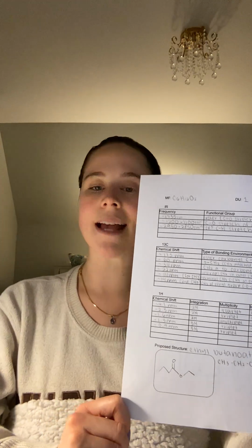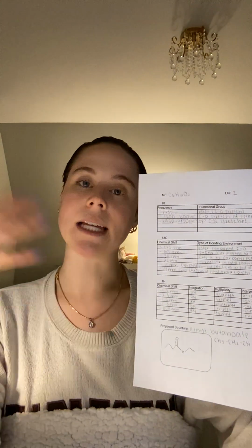And next to this is the 3H triplet at 0.9, which shows the terminal CH3 in the butyl chain. And lastly, I wanted to go back and point out the 2H triplet that is at about 2.3, and this is a CH2 next to the carbonyl.